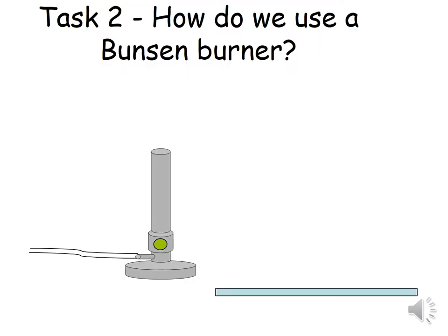Before we start any practical within science, we always make sure that any long hair is tied back. We also make sure that everybody is wearing safety goggles. Even if you wear glasses normally, you would need to wear safety goggles on top of your glasses. Your normal glasses are not a substitute for safety goggles.